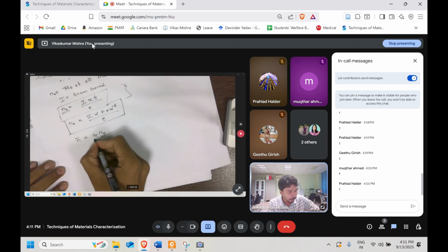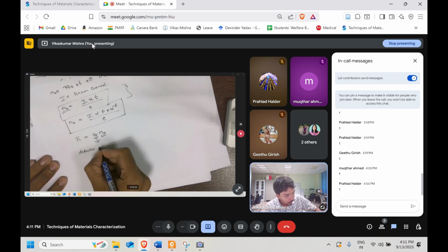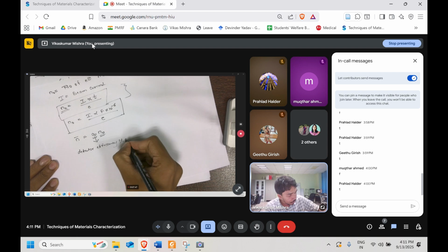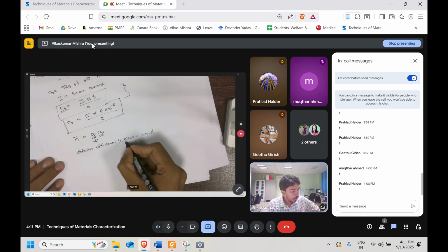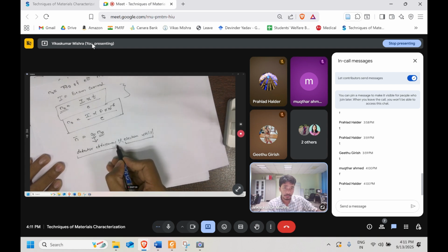Some factor will be left over, and this is the multiplication of the detector efficiency multiplied by the electron yield, the number of electrons generated multiplied by the number detected.